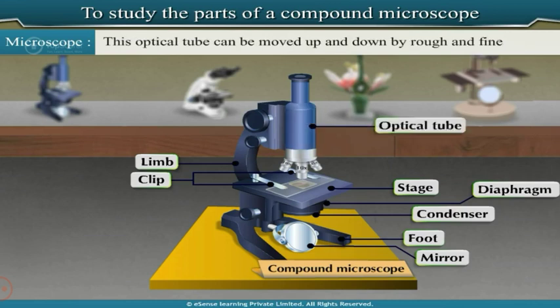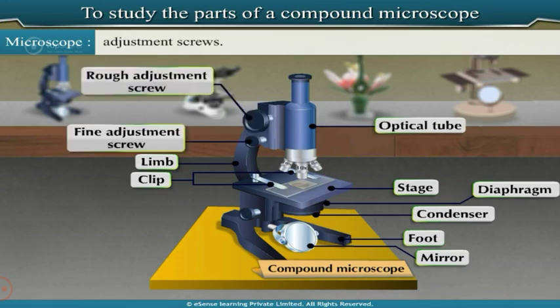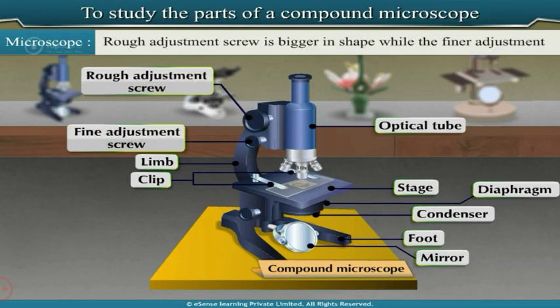This optical tube can be moved up and down by rough and fine adjustment screws. The rough adjustment screw is bigger in shape, while the finer adjustment is done by the smaller screw.